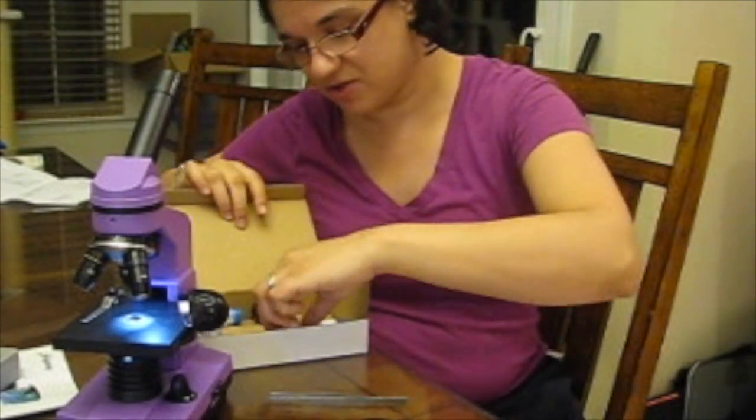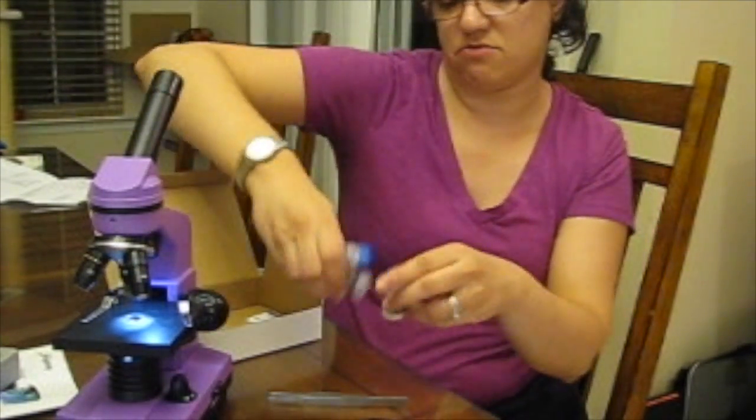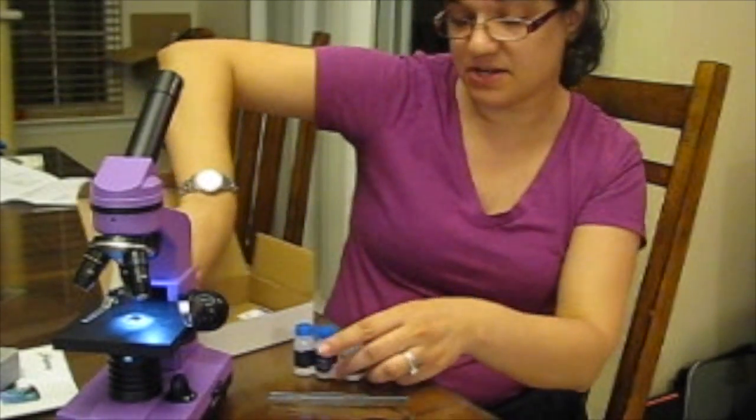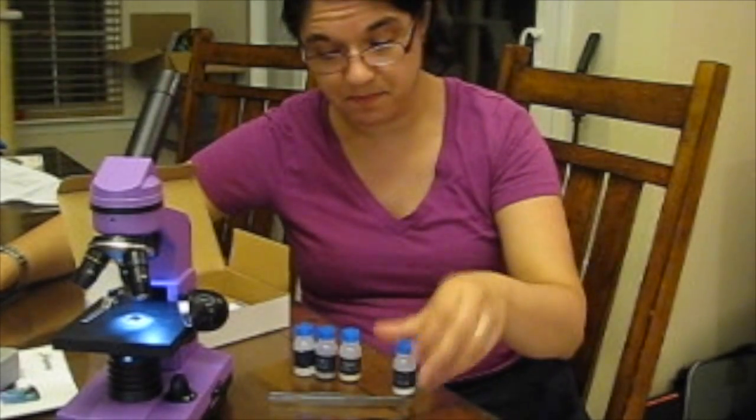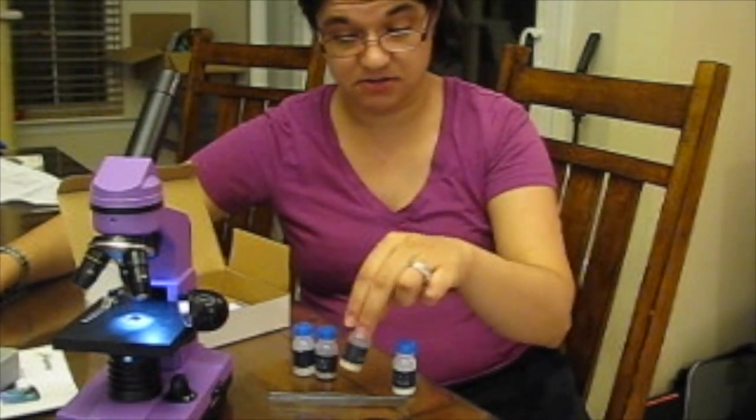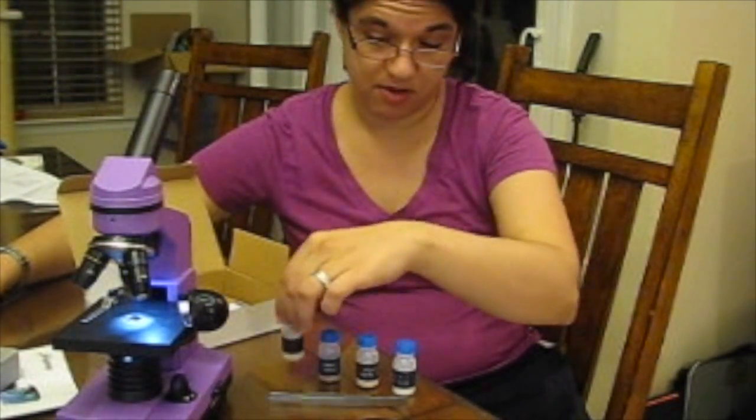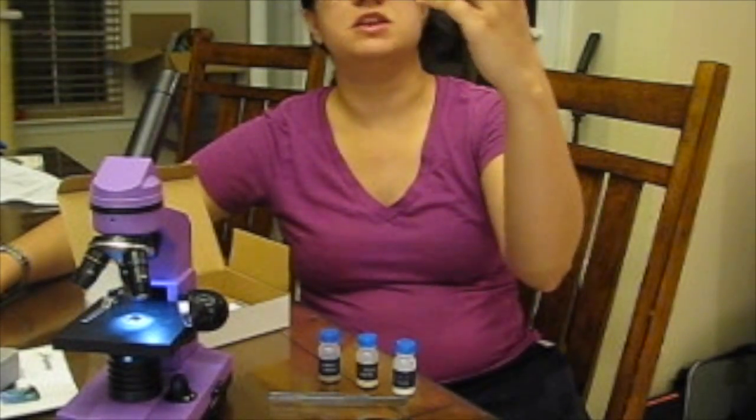And then the really cool part is it comes with four vials here of materials that are used in the experiments in the book. We have sea salt, yeast, brine shrimp, and gum media.